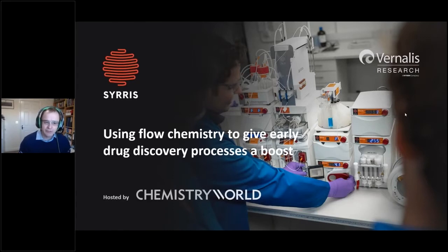especially using modular flow reactor setups that have the flexibility that you might need in that kind of discovery and hit to lead environment, and then finishing with an example of a company that is putting these things into practice as it refines those screening hits into lead compounds that are going to progress further through the drug discovery process.